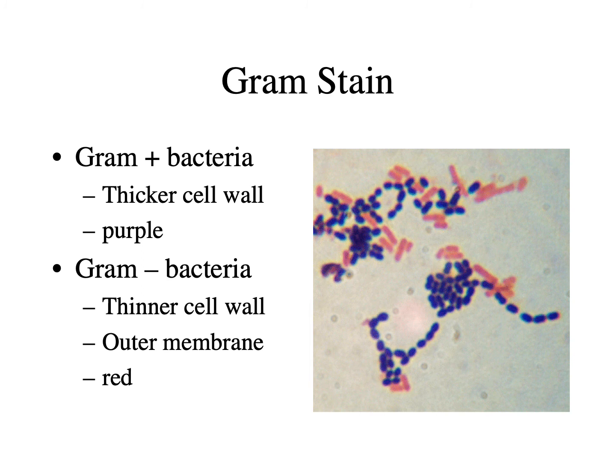Gram-positive bacteria are the purple ones, and in this case, they are streptococci. And the gram-negative bacteria will look red. And in this case, they look like bacilli, so a little bit more rod-shaped. So it's literally purple or red that are the results. And if it's done well, it's really obvious to tell the difference between gram-positive and gram-negative bacteria based on color.